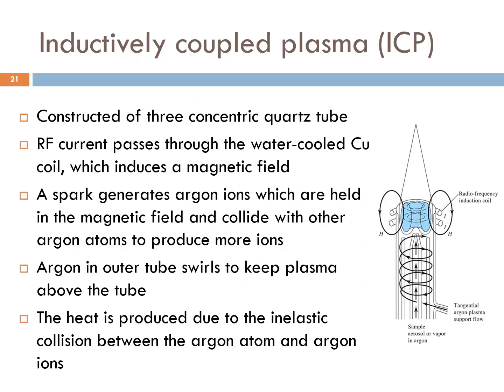Okay, so untuk inductively coupled plasma tadi yang saya duk terangkan tadi macam mana plasma boleh terbentuk tu tadi. So lepas plasma tu terbentuk barulah sampel akan masuk lah dan akan berlaku atomization and all kat dalam ni lah. Sama juga proses macam dalam flame.